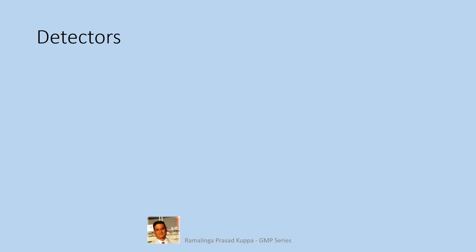Let us see what kind of care is required to maintain the detectors well. Keep the detector clean for consistent results. A dirty detector cell can cause excessive baseline noise and decrease lamp energy in HPLC analysis. For cleaning the cell, reverse the flow cell inlet and outlet lines. Start the flow at a very low rate, ensuring that the back pressure remains below the maximum rating of the flow cell. Flush at a low flow for at least 1 hour.